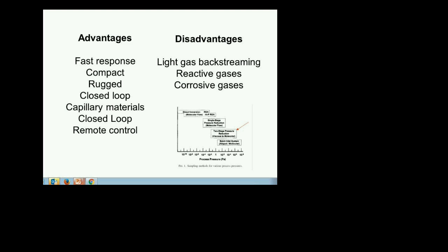This is what I would do. You get your vacuum system, take the Penning gauge off, and put a blank on it. Then fire up the vacuum system, fire up the RGA, and start collecting a spectrum. Once you have your first background spectrum, grab the Penning gauge and put it right where you think you're going to put it, and see if the spectrum changes.